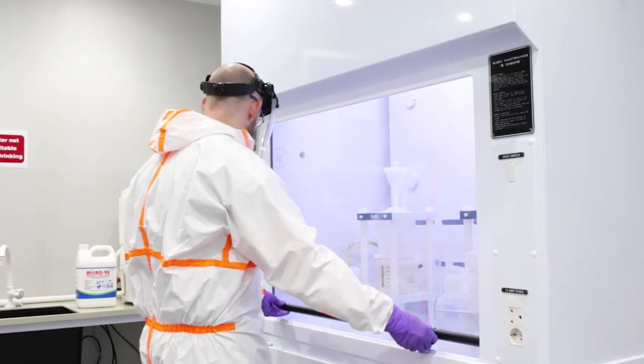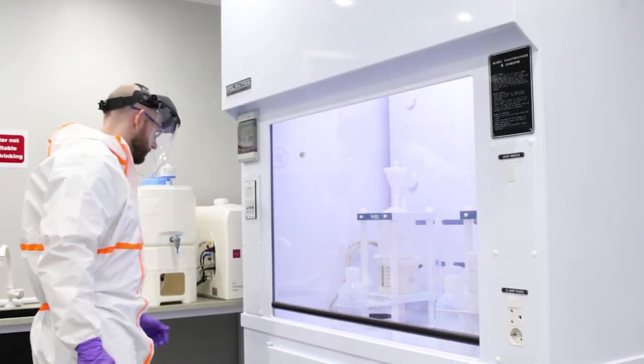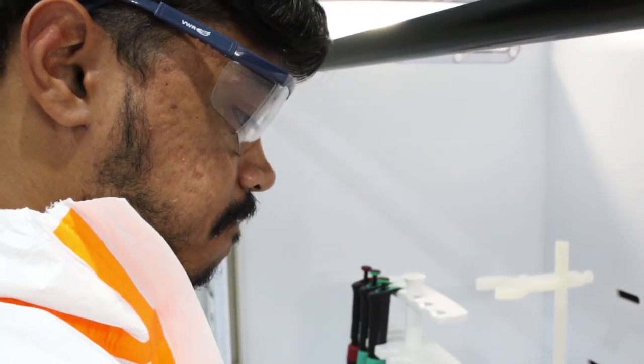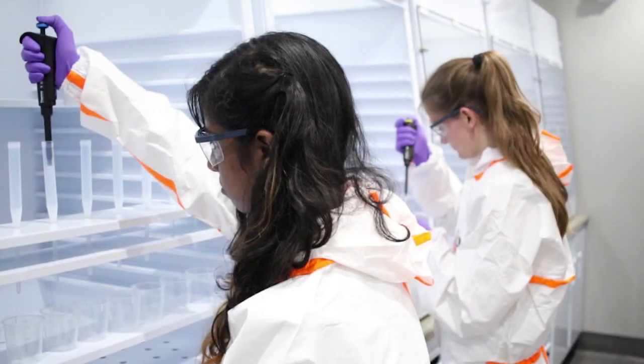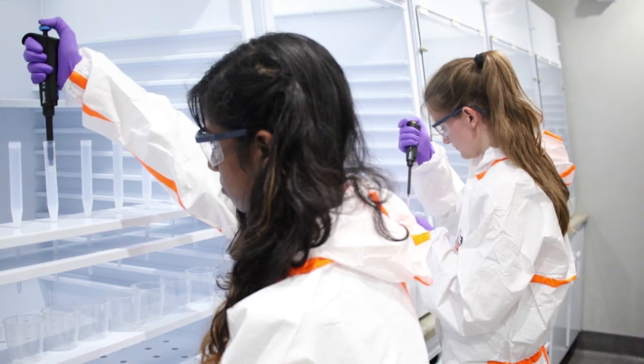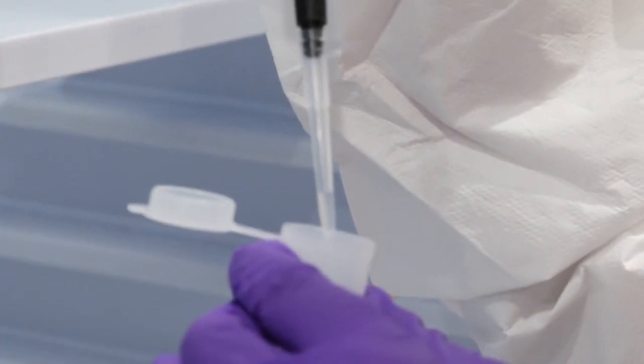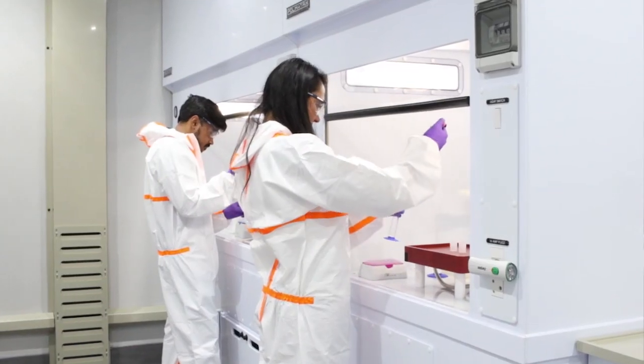So we have designed the WITS Isotope Geoscience Laboratory to be a multidisciplinary facility in which we envisage many different scientific groups coming to work. And so we hope in the future to have as many different groups from different disciplines coming into the laboratory and working here and then measuring these isotopes on different mass spectrometers around the world.